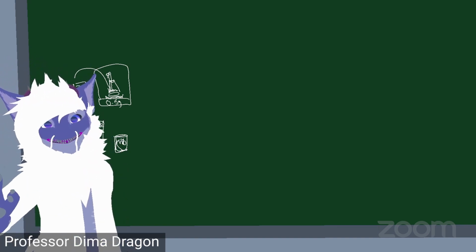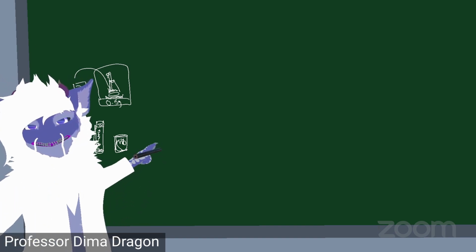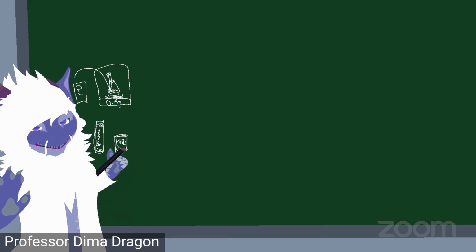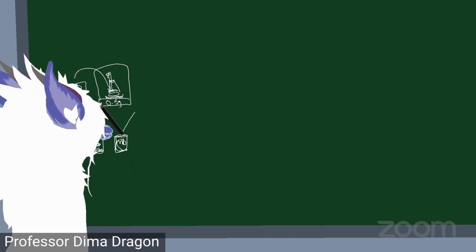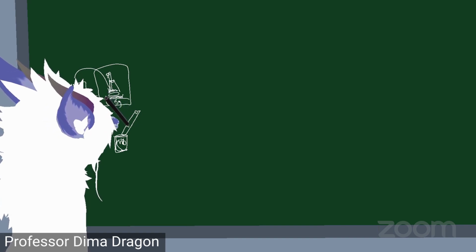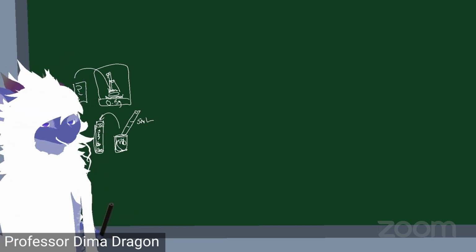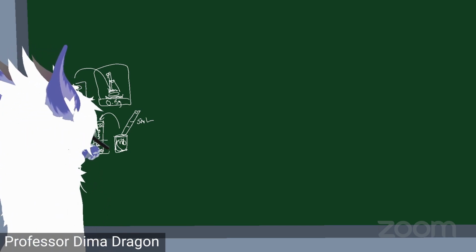You're going to label this with the Norleucine. That's the Norleucine internal standard. Leucine is also going to be found in your amino acid, but we're going to use the Nor part of that, which is the amount that we know we added in. Using a glass pipette, you're going to put in 5 mils of this internal standard into this combustion tube. I'll give you all a little rack to set these in.